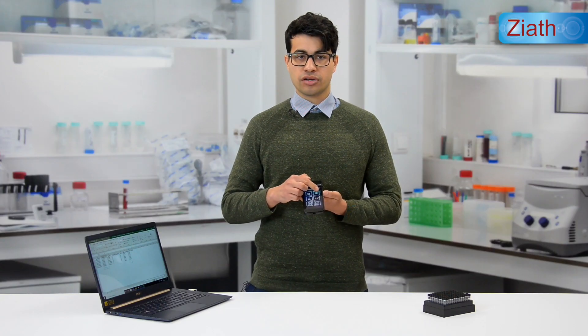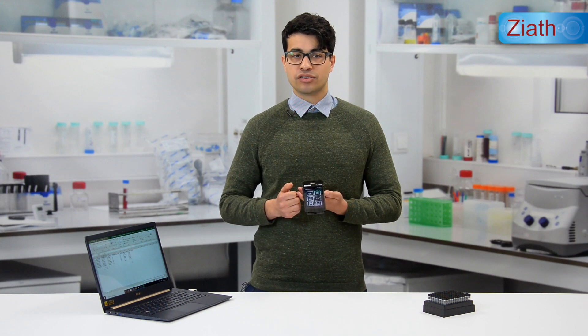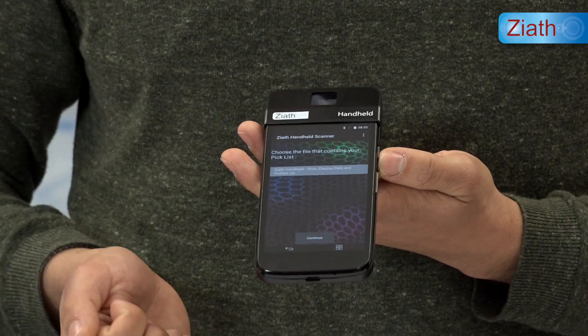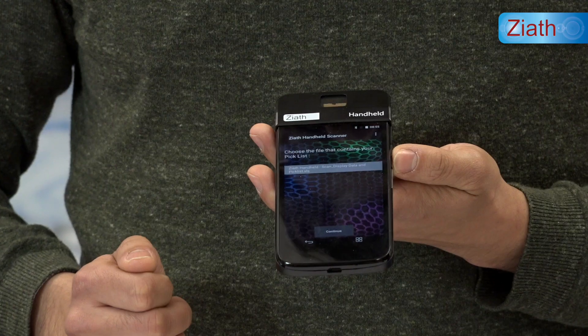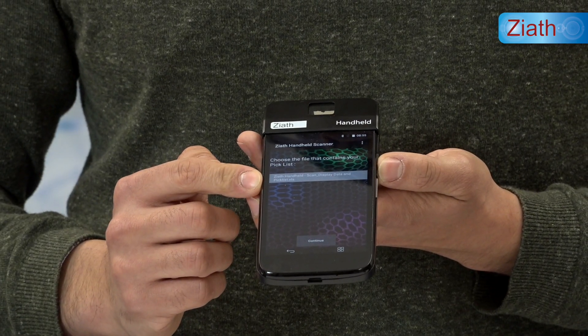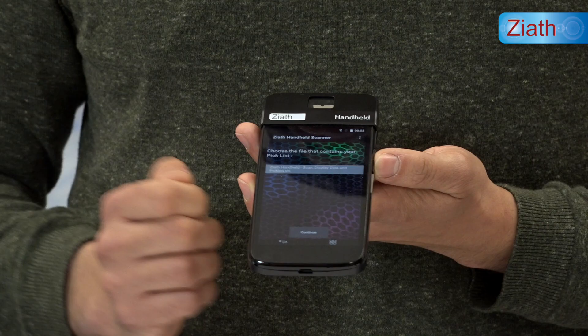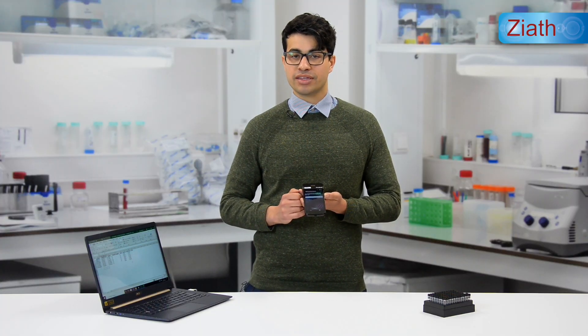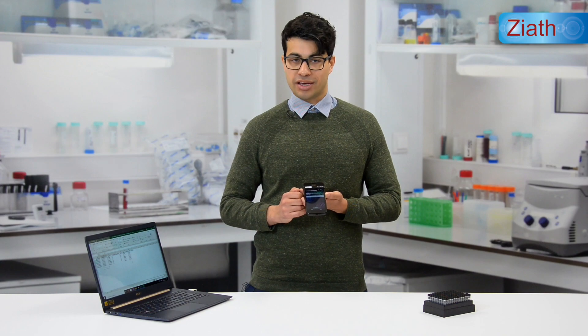For the pick listing function, we can display a list of tubes that need to be collected. With these tubes we can also display the sample information of each individual tube and even where the tube is located. If I open up the pick listing application, you can see there is an Excel file already placed on the handheld, which I moved onto the device by connecting it with a micro USB cable and using the handheld client application.